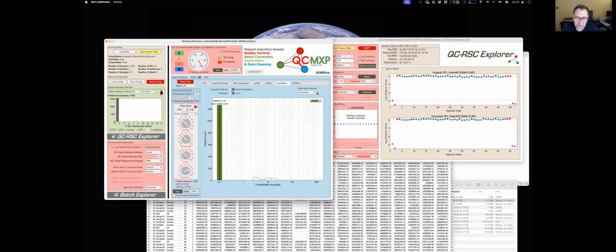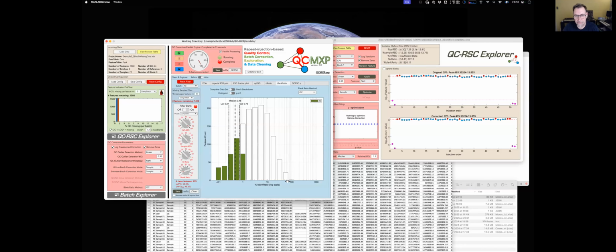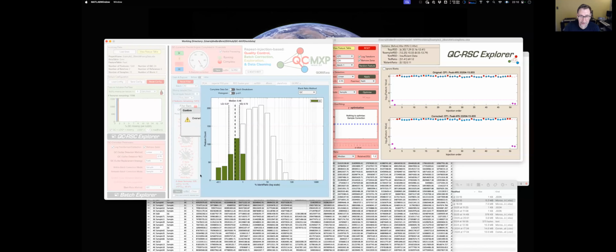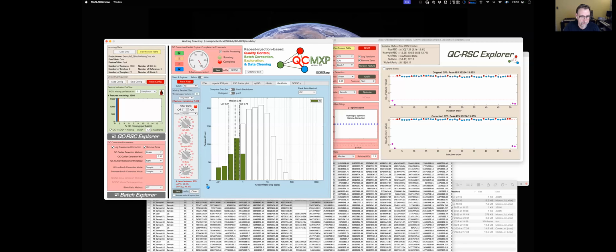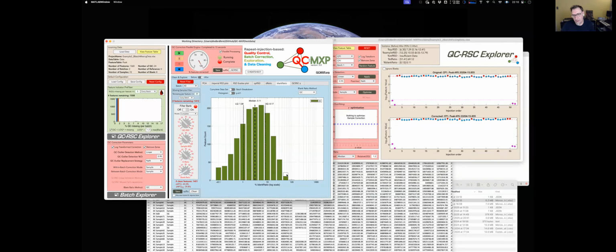But when I talk to analytical chemists, they far prefer the idea of it being way above the blank, and that's where the 10% comes in. But you don't have to set it to 10. You could set it to 50. You set it to whatever you like. There is nothing set in stone. I think 50 would be fine.